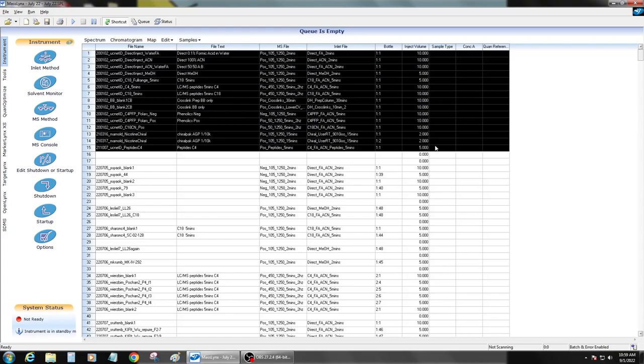September 1st and it's time to make a new project on the QDA here. So I'm going to copy the set of standard stock methods that people have been using from the top of the list here.